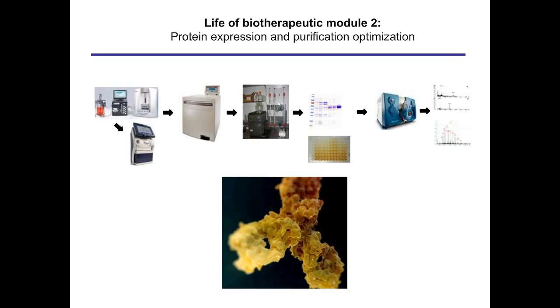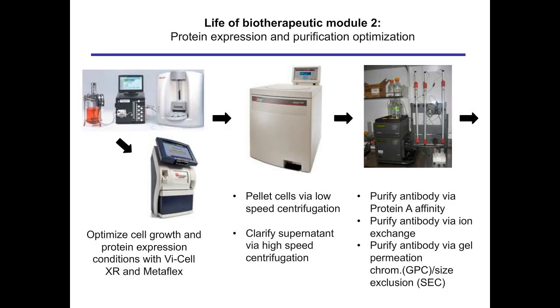Usually there's some centrifugation step depending on the process size, but at small scales, typically a centrifuge is used to pellet cells, and then there's some process of purification via column chromatography and following or tracking the expression with acrylamide gels and or the functionality using enzyme-linked immunosorbent assay or ELISAs, and then some subsequent follow-up with mass spectrometry to confirm the size and the glycosylation state of the therapeutic proteins. So let's talk a bit more about that.